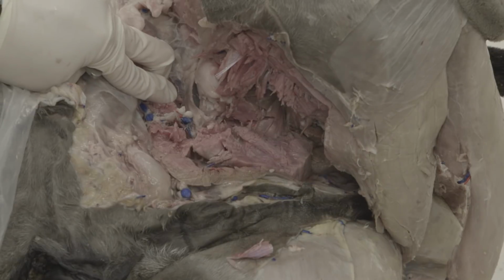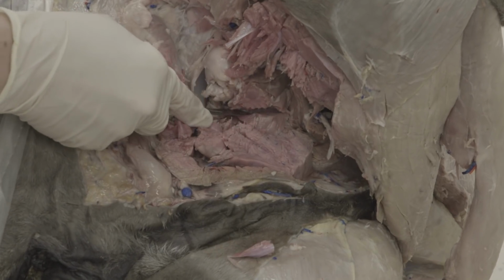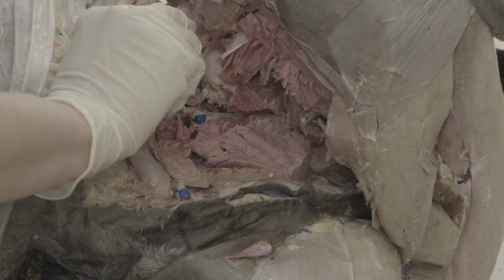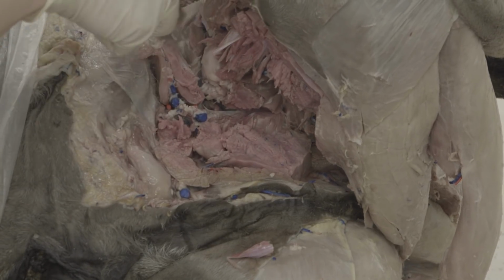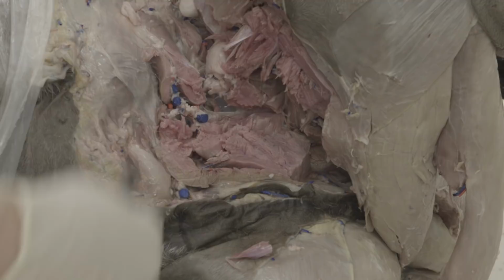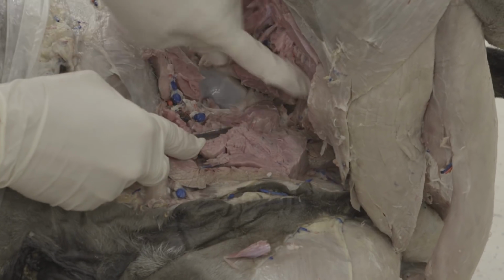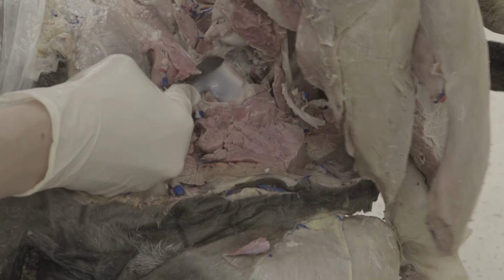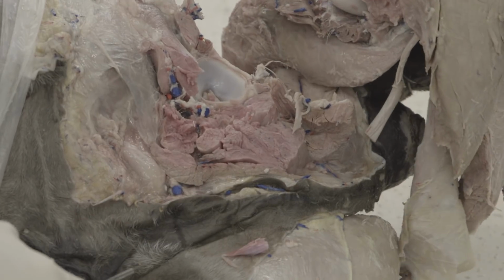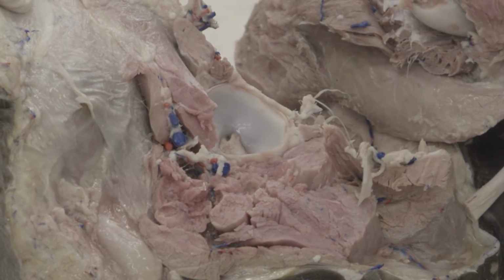All right, so after you see that, then you have to cut that too. And then you'll hopefully be able to remove your left limb. And just finish cutting through all of the things attaching it. Anything that's left, here I have to cut through iliopsoas. So I got a vessel here that needs to be cut. And then if you start lifting it away, perfect. And we are almost there. And there we go. So now I have detached my left limb, and you can see that hip joint there, that hip socket, and the head of the femur there. So you completely remove it and then bag your left limb separately.